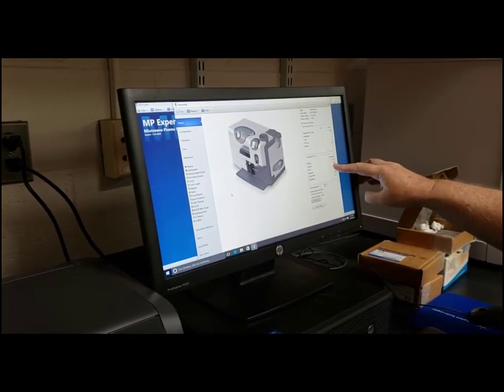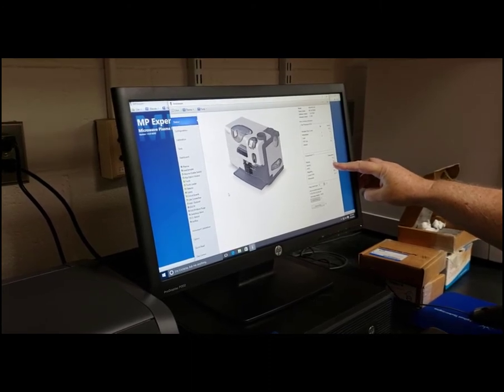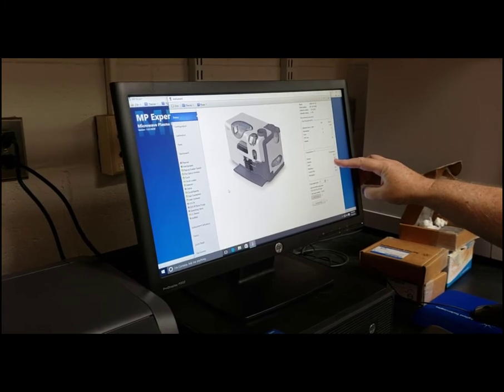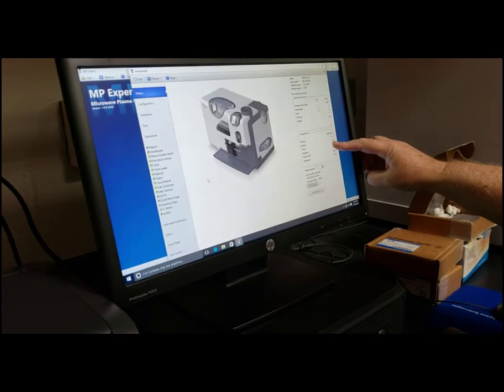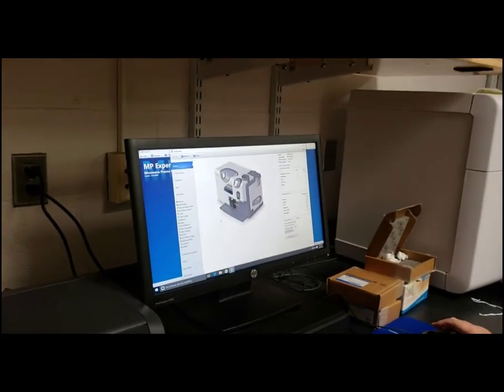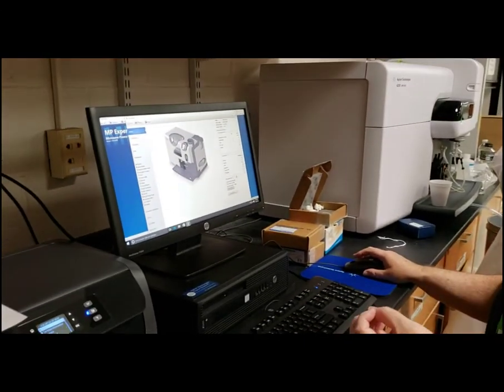We also want to make sure that our detector is around 0 degrees, and we're a little slightly under, which is good. The detector has to be cold because we want that solid state detector to be subambient. I told you yesterday in this presentation there's a device called a Peltier cooler.